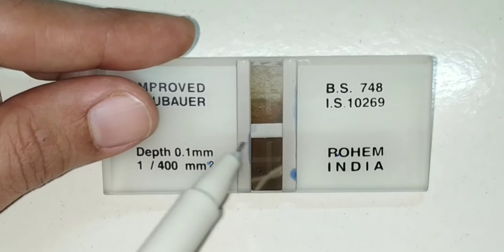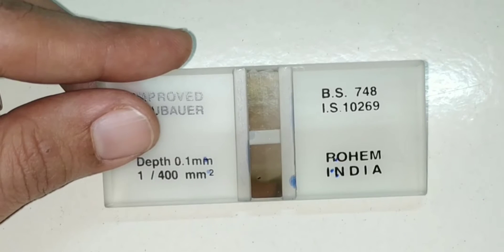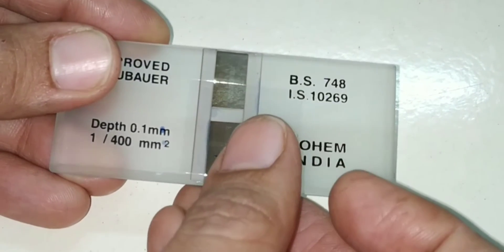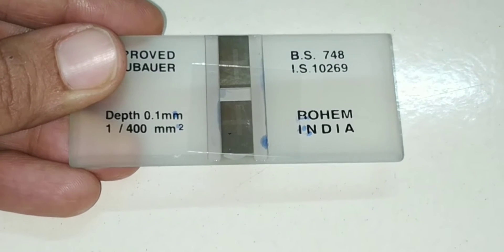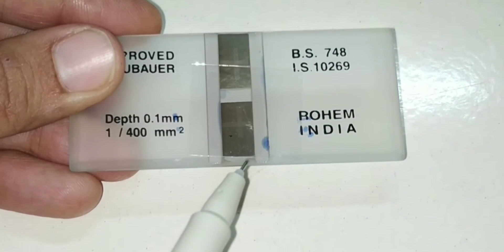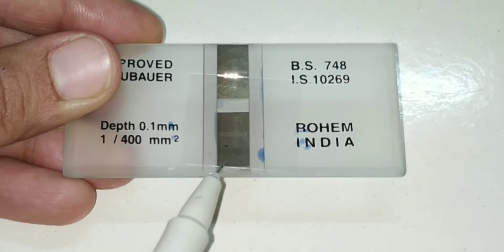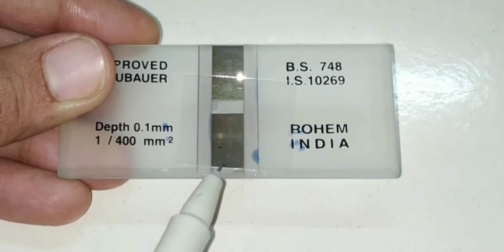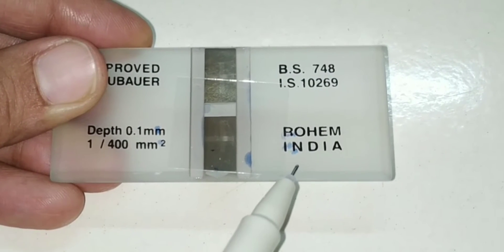The two lateral platforms support a cover slip when it is placed over the chamber. When we place the cover slip, these two lateral platforms support it. The volume of the chamber formed by placement of the cover slip is 0.1 cubic millimeter, as the central platform is 0.1 mm lower than the two lateral platforms.